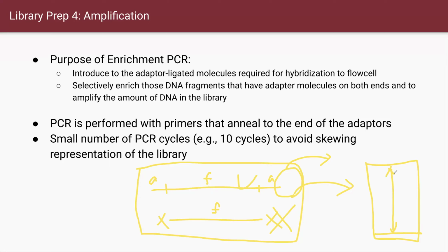But some students might have some questions like, professor, you can get the ligation efficiency up to 100%. 100% is not real. So let's say ligation efficiency currently is 80%. So we see an 8 to 2 proportion of this situation, but you can advance your kits to make efficiencies like 99.9%. Then you won't think about this unligated situation, right?